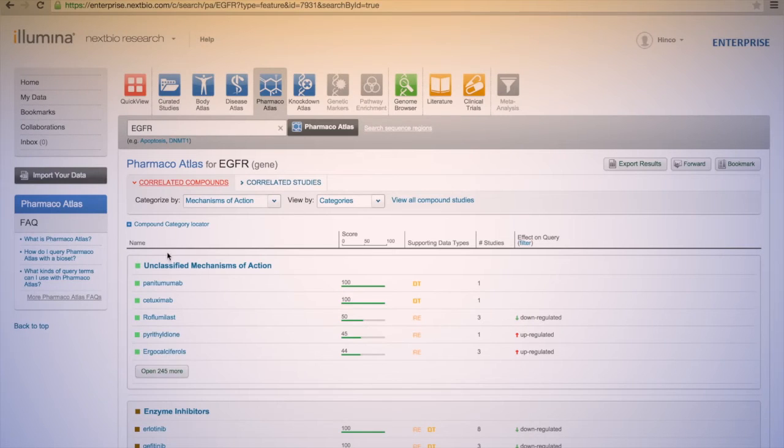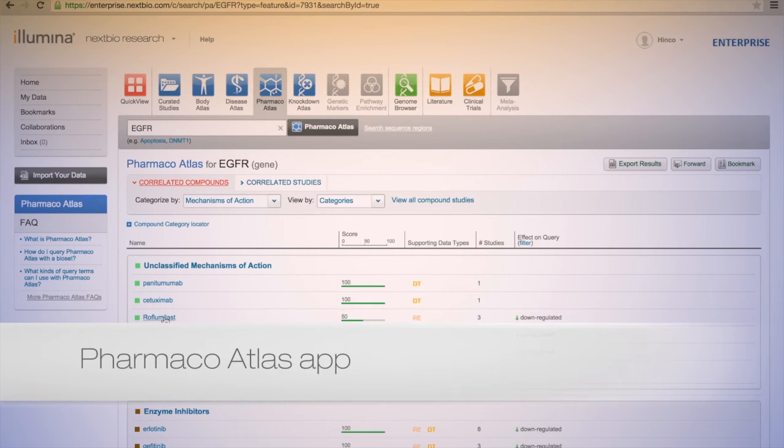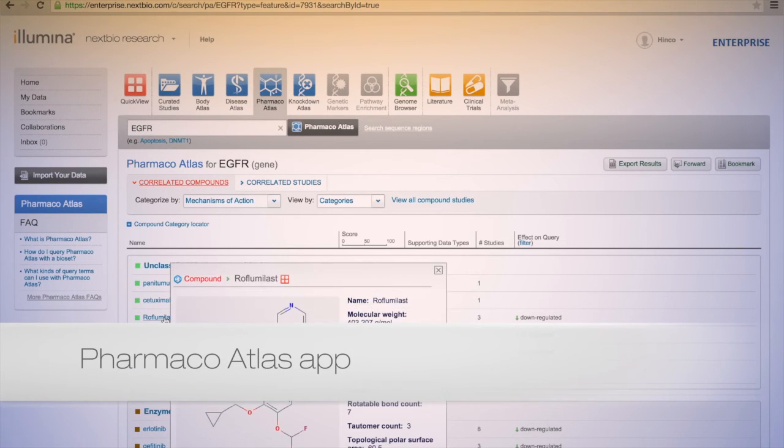Discover compounds and treatments to a gene, sequence region, biogroup, or bioset with the Pharmaco Atlas app.